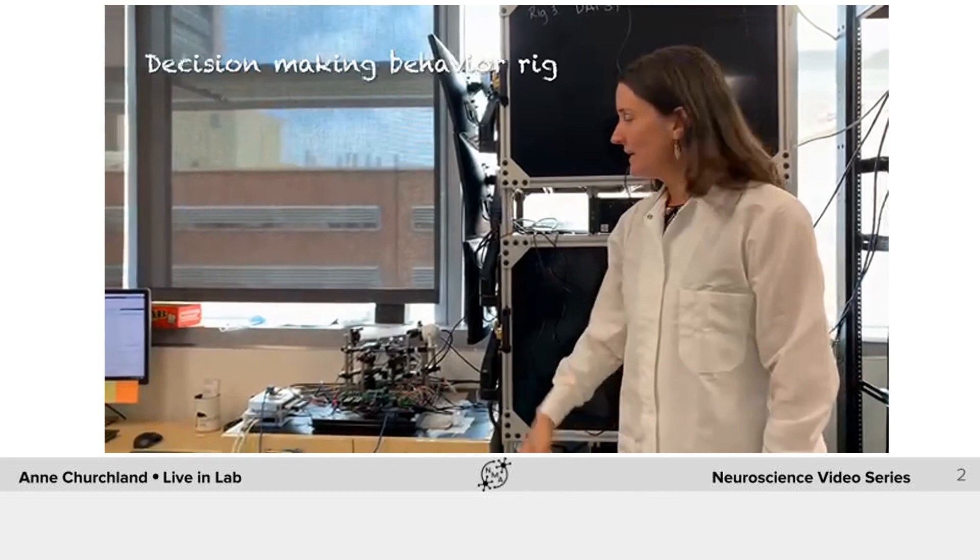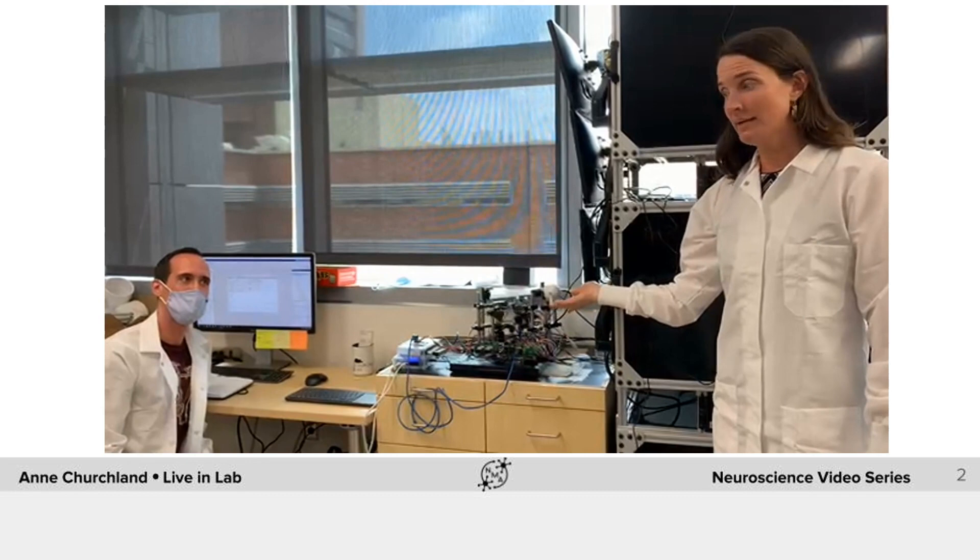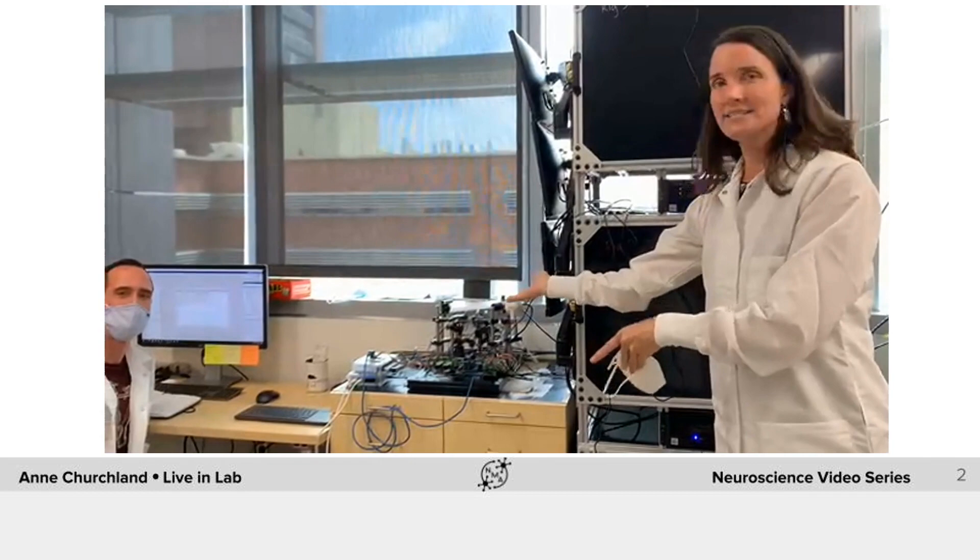Over here we have another postdoc in the lab, Mike, who's also studying decision making. He has here a behavioral rig that's the same one that you'll see in a moment in the wide field imaging rig. But because it's out of the behavioral booth you can get a really good up-close view of what it looks like and Mike can tell you a little bit more about it.